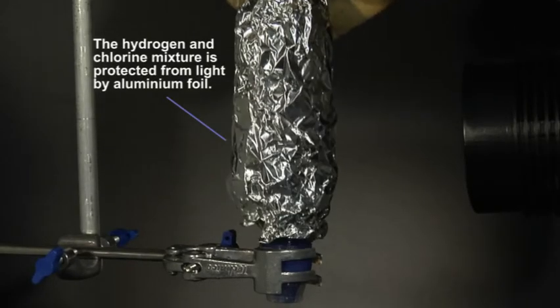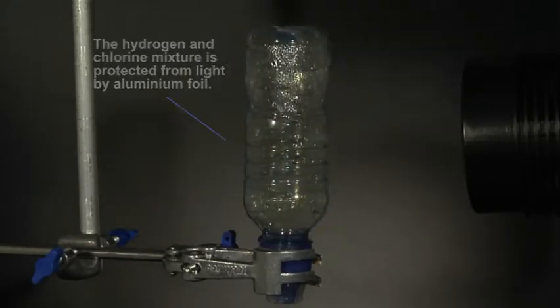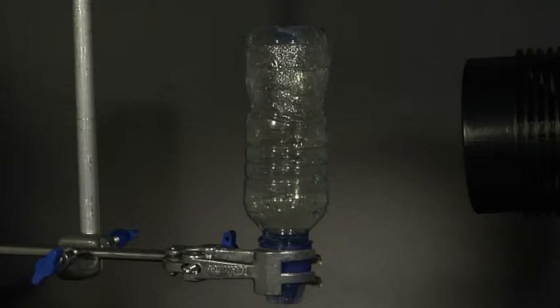This plastic bottle was filled with an equimolar mixture of hydrogen and chlorine by displacement using pure gases from cylinders. The bottle is securely clamped in a fume cupboard and a powerful flash gun is placed near to the bottle.